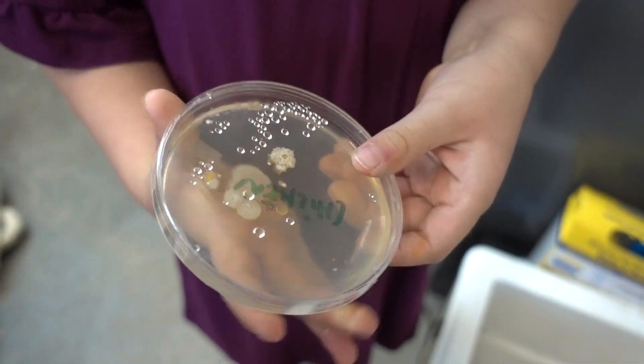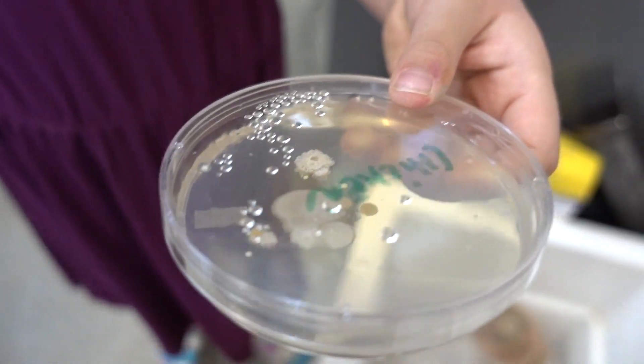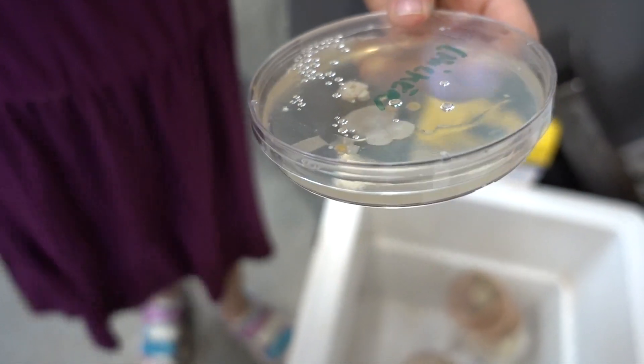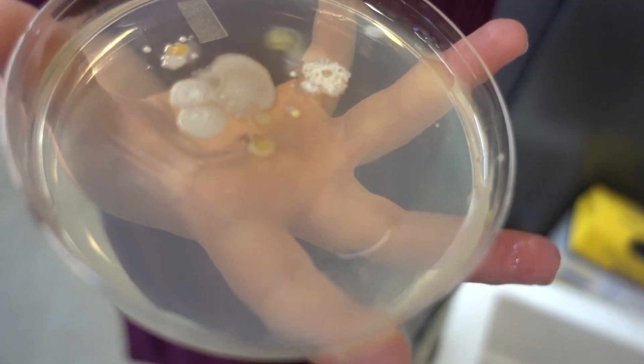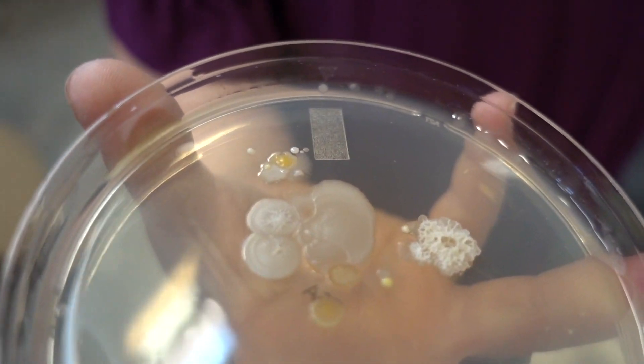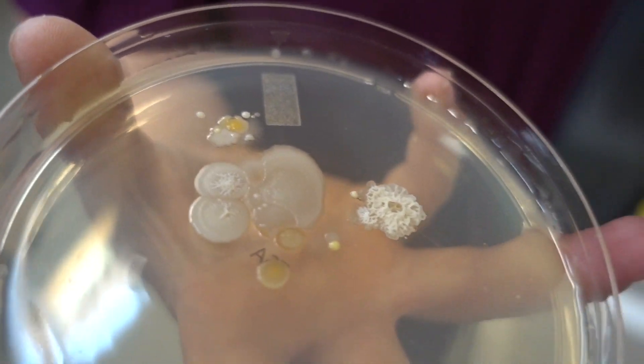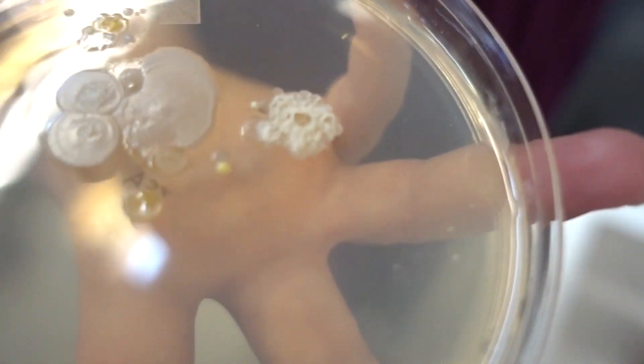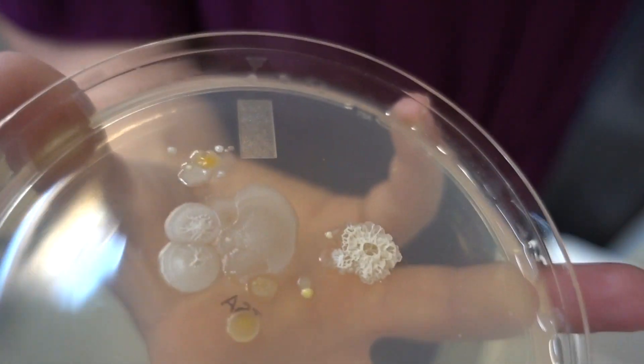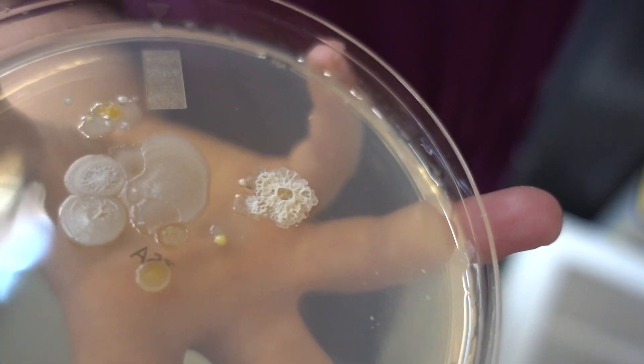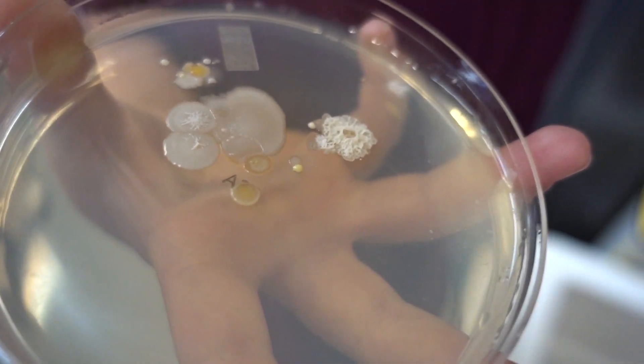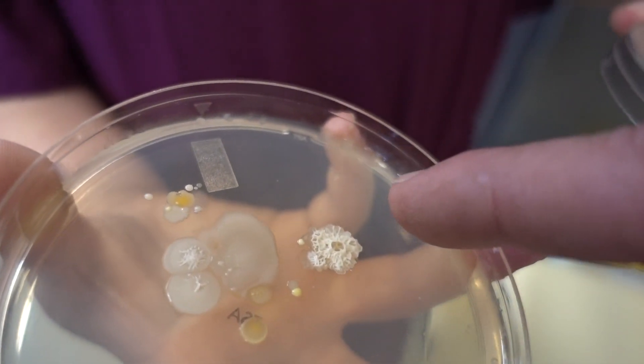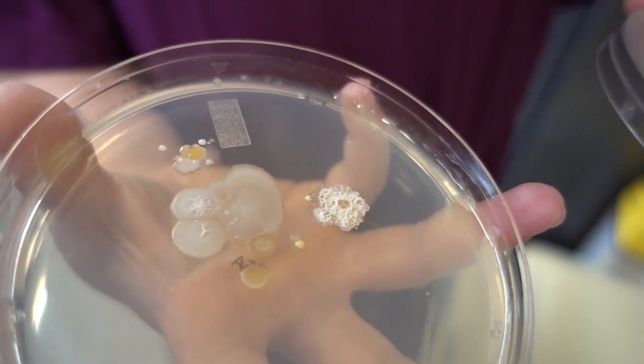Chicken, why is it leaking? It's just condensation. It's okay if it's on me. Is it not germs? There's not germs. We'll wash our hands. Do I need to wash my hands? Yeah. After. Okay. Take the lid off. That's what's on your hands. So I see some E. coli. Those are poop germs. And some Candida. Candida's interesting because it's a fungus that's, fungus amungus! Yeah. It has two modes. It runs as a yeast and as a hyphaeal fungus. So it's got little tentacles.